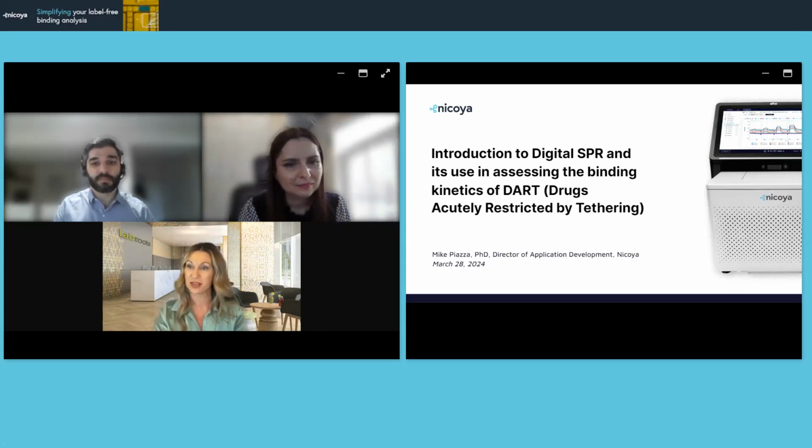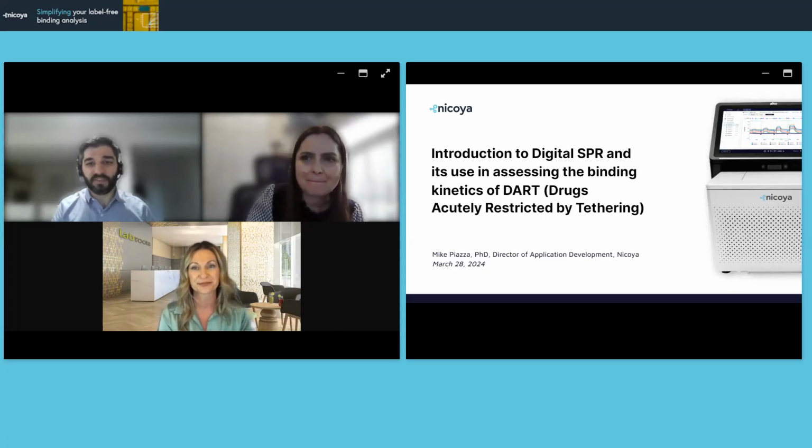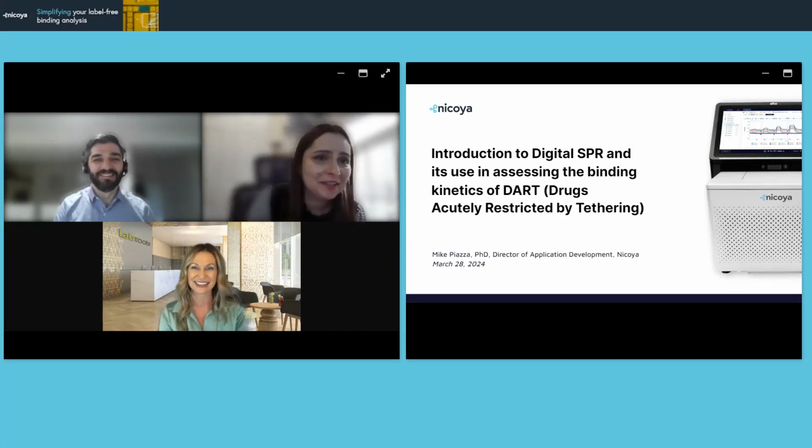Thank you. And Mike, Victoria, this question has multiple parts, so I'm going to read the whole question and then let me know if you want me to repeat any part of it. Thank you very much for this nice webinar. What is the typical analysis throughput with Alto? For example, how many samples can be analyzed in 24 hours? And what is the typical hands-on time? If you're okay with that, Vicky, I can take it, and I can then follow up with what our experience was.